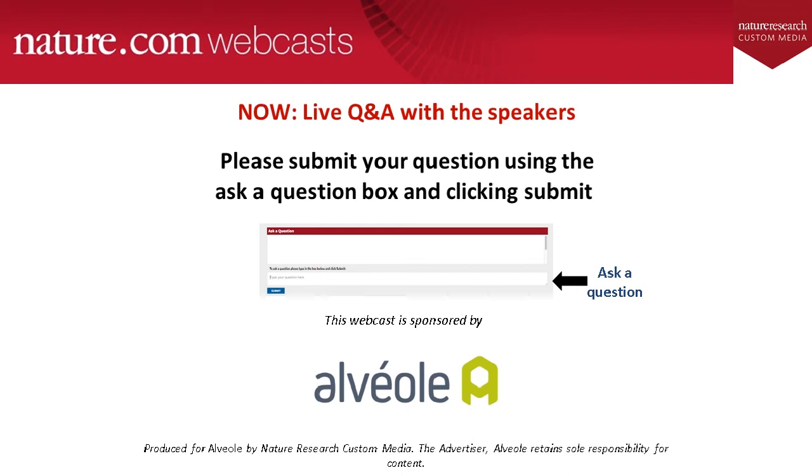That would be kind of interesting if the person who wrote the question wants to email me offline. It could be an interesting thing to think about. I'm not sure what ECM protein you would use, but if they stick to some ECM protein, there's no reason why it wouldn't work. Just passivate the surface where you don't want them to go and hope that they settle in the other regions. I mean, if it's a roundish body, I would just micropattern filled-in circles and hope that they settle on those ECM regions.